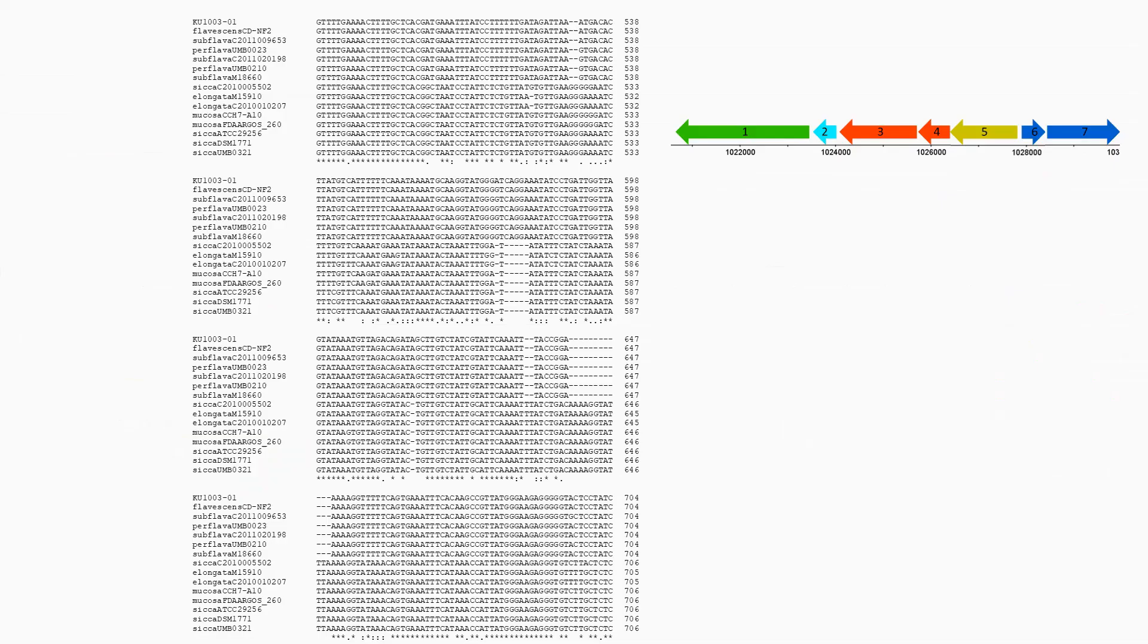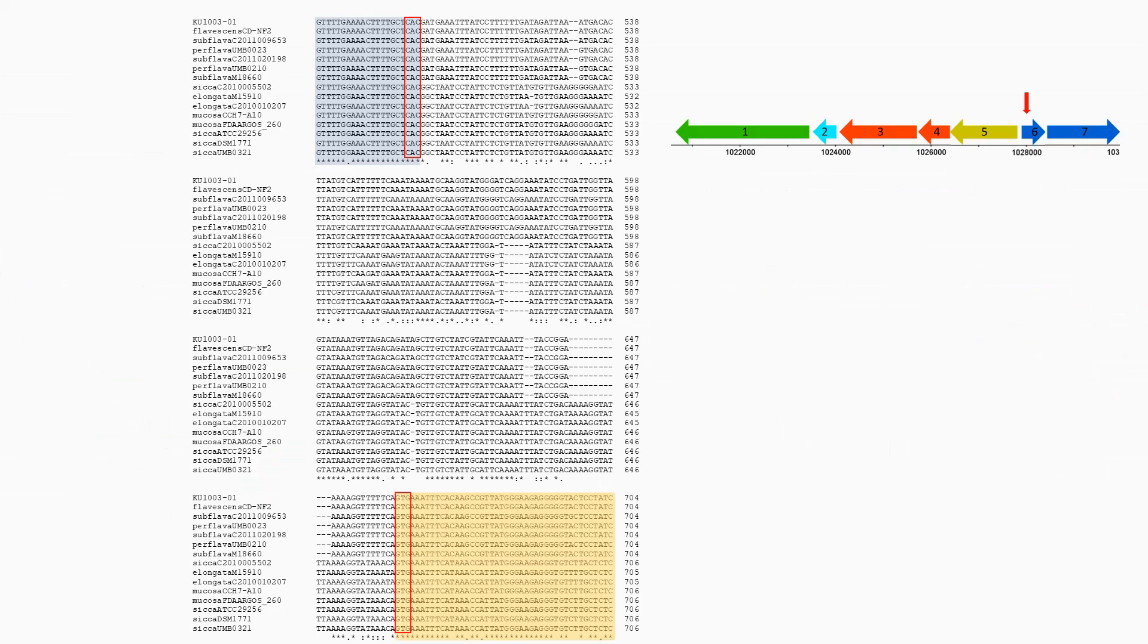Looking at the alignment again, with that new predicted start codon, hypothetical gene six, and hypothetical gene five there. This is what it would look like with that new start codon of GTG.